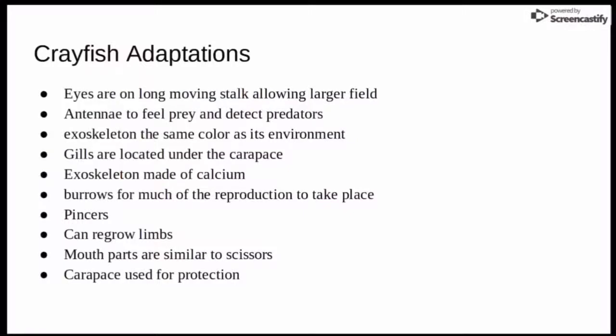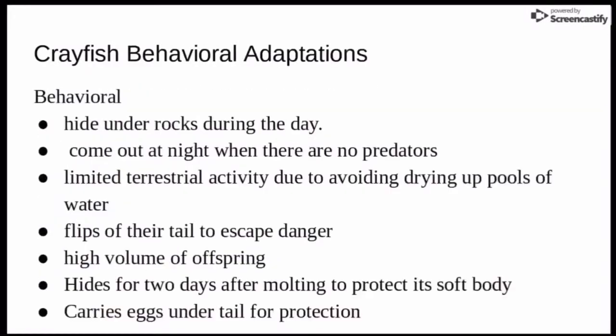The crayfish burrow for much of the reproduction. Pincers are used to protect themselves. They can regrow limbs that are lost in a fight. And the mouth parts are similar to scissors to cut food. The carapace is used as protection.